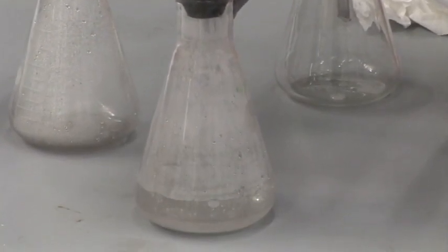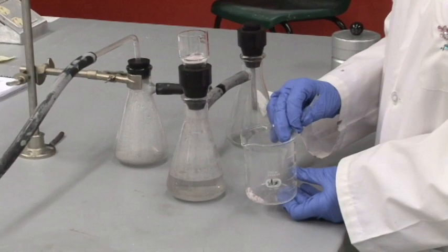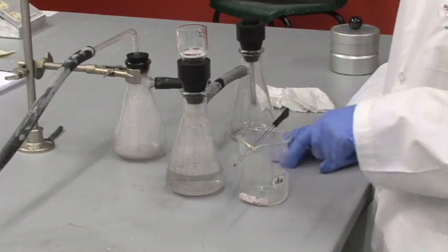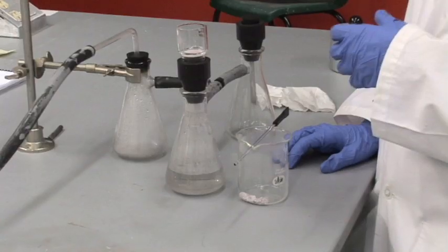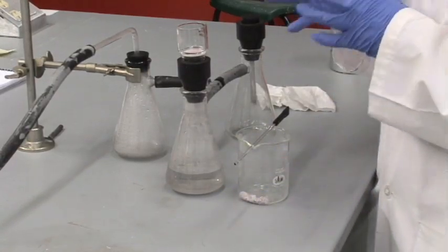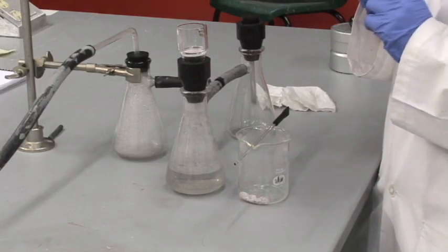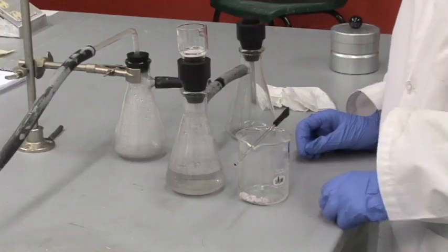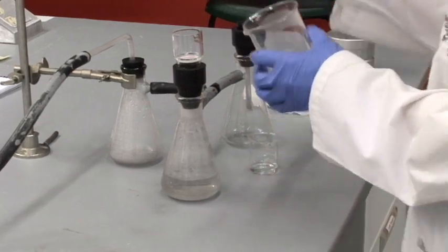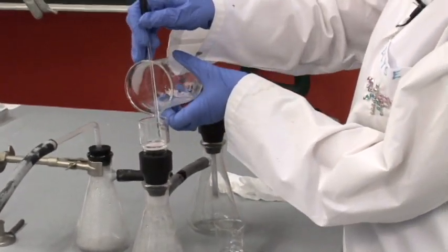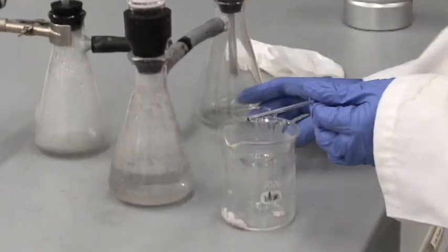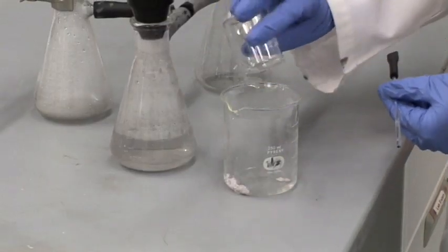So some of the precipitate did go onto the filter but most of it is still in the beaker. The next thing that you'll be doing is rinsing the precipitate with some dilute nitric acid to ensure that the coagulated or the larger pieces of the salt do not break back up into the colloid, so the very small particles. So you'll be adding just a few mils of nitric acid to the precipitate in the beaker to wash it. You will decant through the filter one more time.